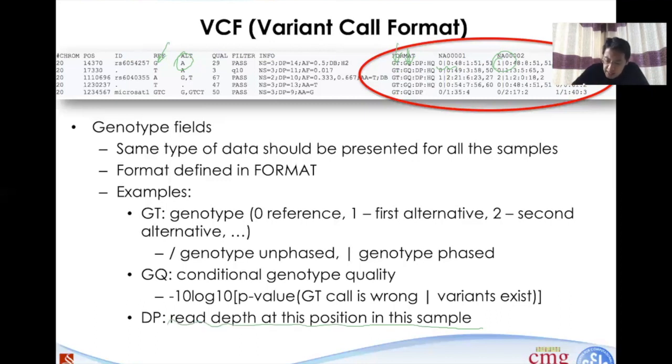You can see this is 1, 8, or 5. 8 plus 5 is 13, plus 1 is 14. So collectively, across 3 individuals, the overall sequencing depth is 14. Now let's go back to the section that defines all the samples at this particular genomic locus, and it is very clear that this is 14.